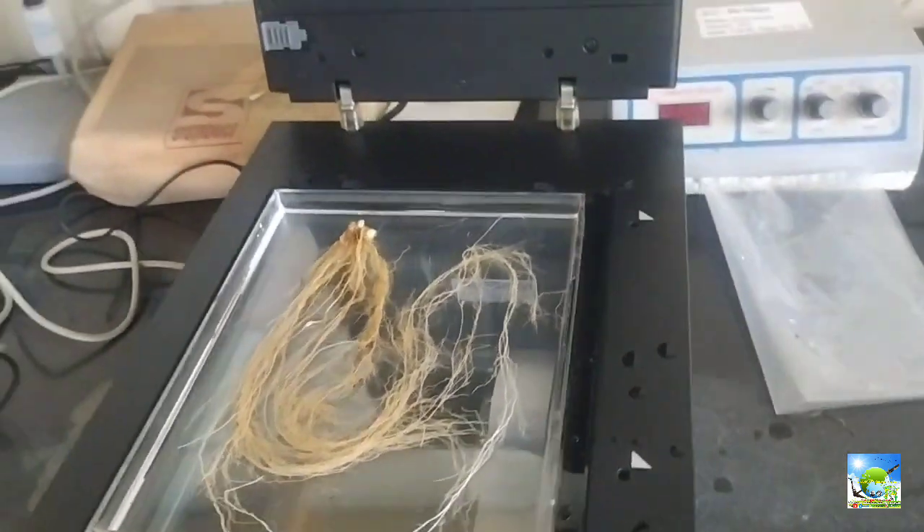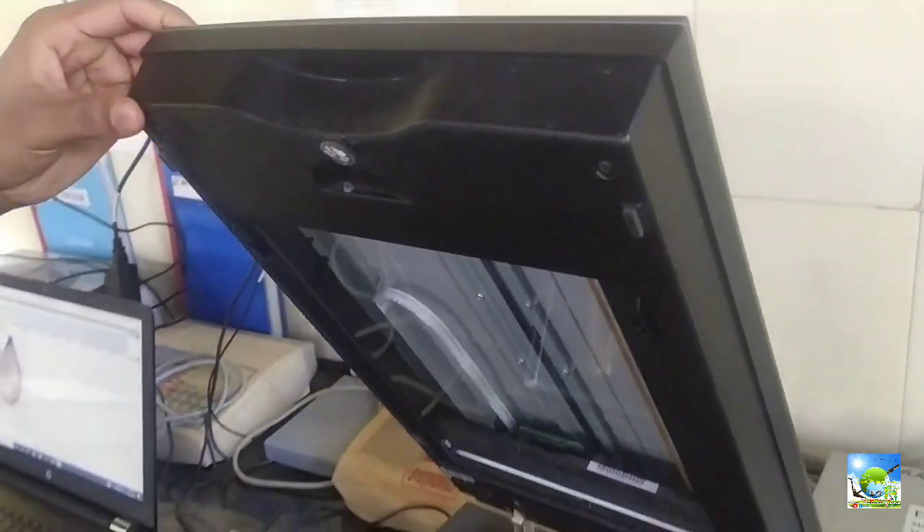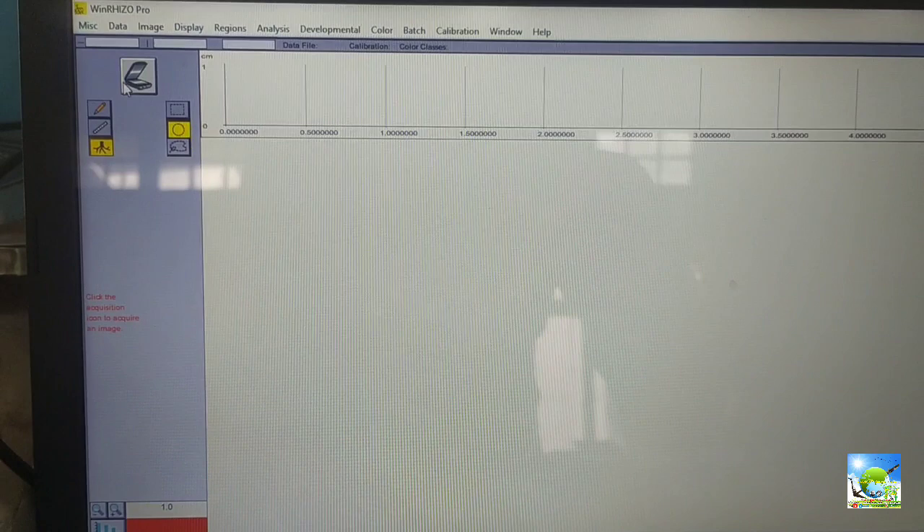If the roots are too lengthy, cut them into two to three pieces, then scan individually and sum the values. Now close the scanner, check the connections, and click on scan image. It will take 30 seconds to one minute for scanning depending on the volume of roots.